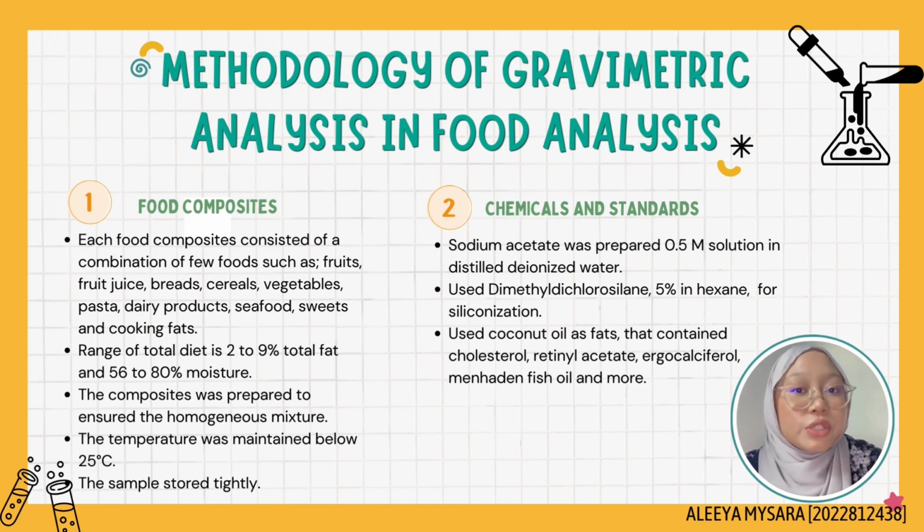The sample was stored tightly in sealed jars and cooled at -60 Celsius. The frozen sample will then be brought to room temperature for complete mixing to obtain a uniform representative subsample. The second method is chemical and standard.